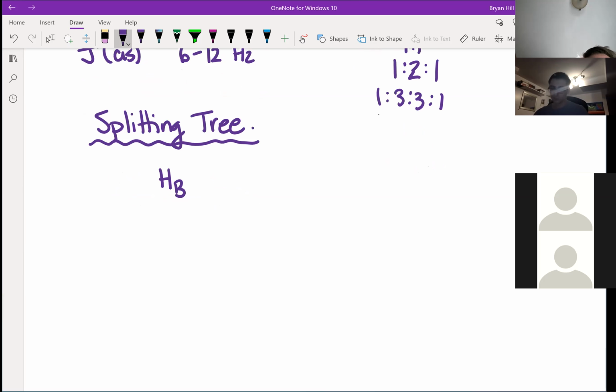and you would normally resonate right where I'm drawing this line here, and you're split by 2 neighbors. The first one for the trans coupling, we'll just split it, say like this. And the difference in Hertz across this value here would be, say, 14 Hertz.